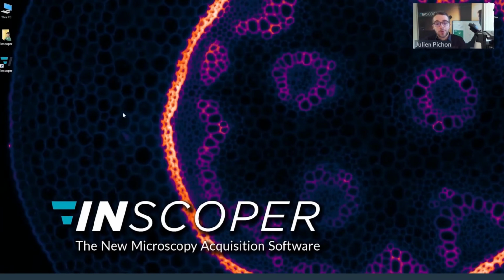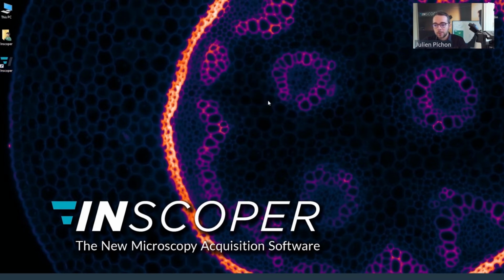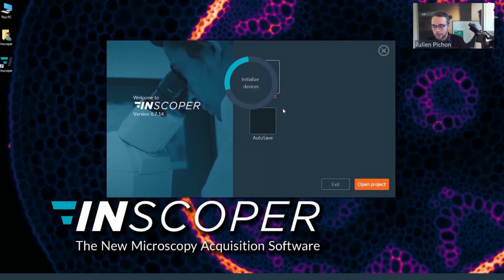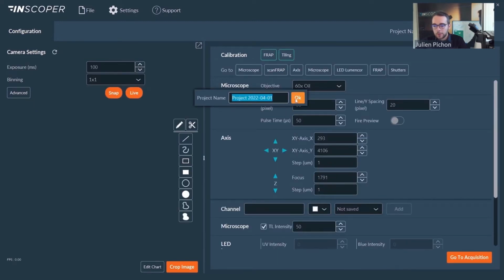Now let's move to the online demonstration. So I'm very happy today to present you the Inscoper scanFRAP. So let's open the Inscoper software. Okay, so now as you can see, all devices are initializing. We will create a new project. And now we are ready to work.